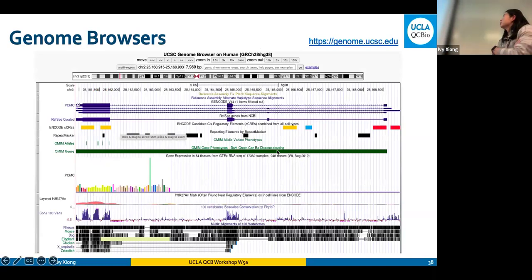So for different genomes, let's have a look. There are different browsers we can use. One of them, maybe you have used this before, is the UCSC genome browser. That's the Santa Cruz maintained genome browser. They have typical genomes that are readily loadable, humans, mouse, and then a couple of other non-standard genomes as well. So this is updated. That means you can choose the versions that you want to work with. And there are archives as well, if you want a specific version. So currently for human, I think it's hg38. That's the latest, and then for mouse it's mm39.